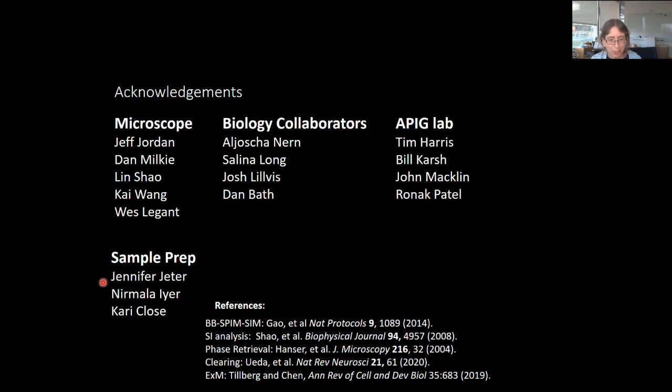Yeah, usually most expansion samples are going to come out pretty close to the correct index. It is worth checking if you're really squeezing the resolution hard, then it's worth doing that. And in general, you're going to need a long working distance objective for that. But 2 millimeters is enough for most kinds of expansion samples. I say that sort of glibly, but expansion goes out to 20x now, and you don't have to start with a very big sample for a 20x expansion to now be a very big sample. There'll be a big demand for long working distance objectives going forward.